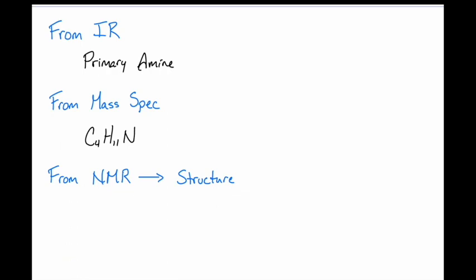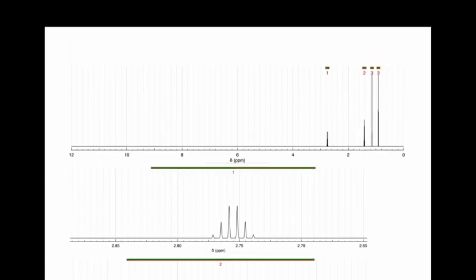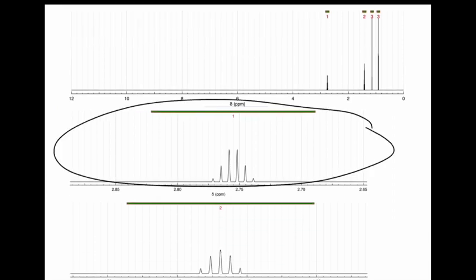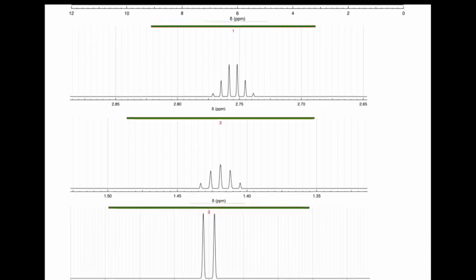and then use that as we're going through, okay? So for our NMR spectrum, and let me just show you here, I have this NMR spectrum. This is the full spectrum here up top, and then each successive image is zoomed in on one of these sets of peaks, right? So I zoomed in on this set of peaks here, and this is what I see. And that's what this file consists of.